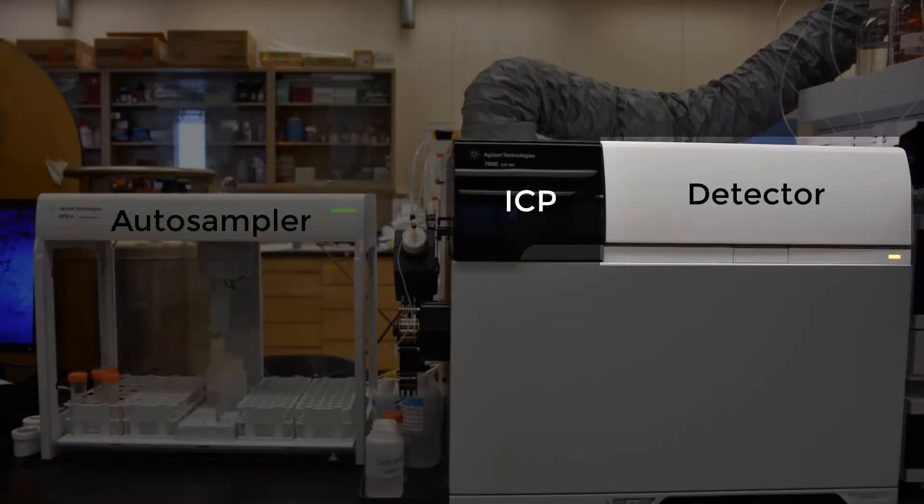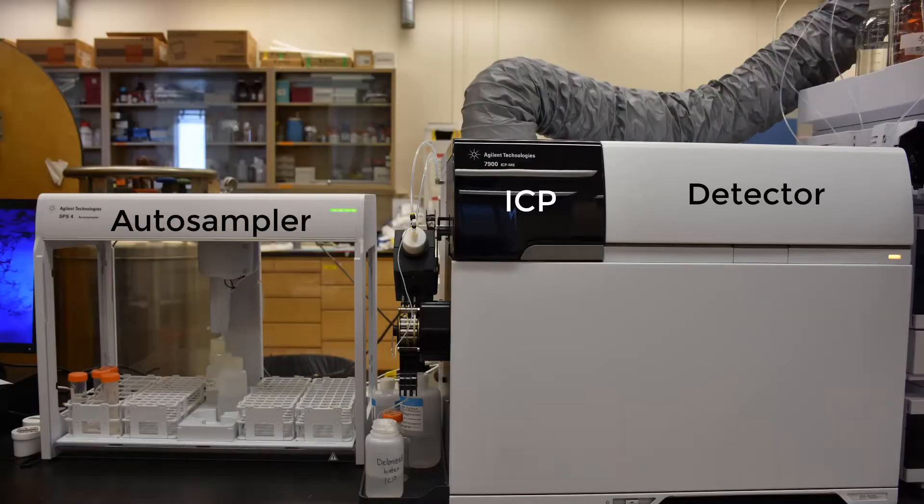In this case, the detector is a mass spectrometer. Atomic emission spectrometers are also common.